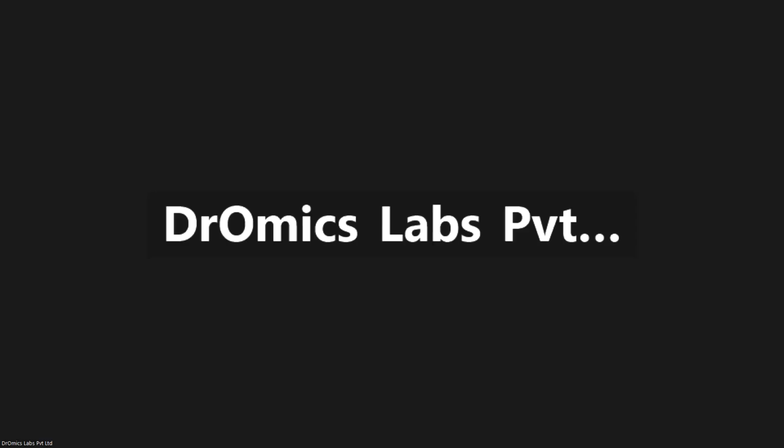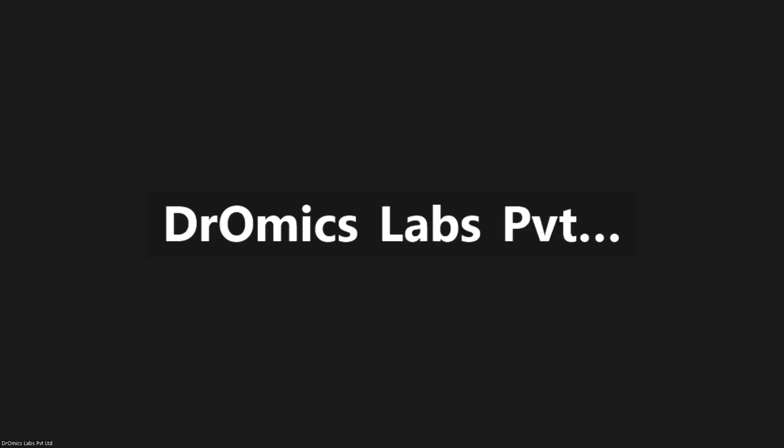So again, I'm getting error because I'm not using absolute path. I'm just accessing it from my Linux. I'm just accessing folders from Linux directly. Yeah, that's fine. From wherever you are accessing, you have to give the path directly from there. You have to open the terminal from the metagenomics folder, correct?